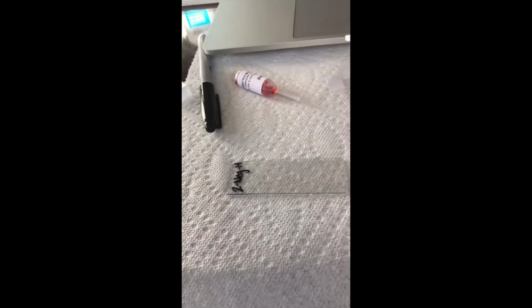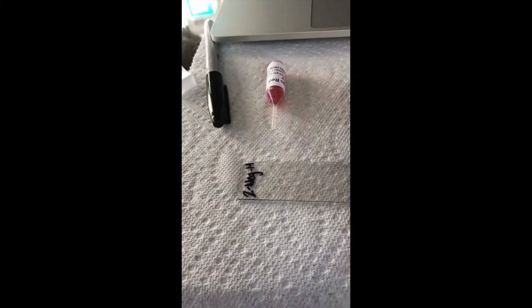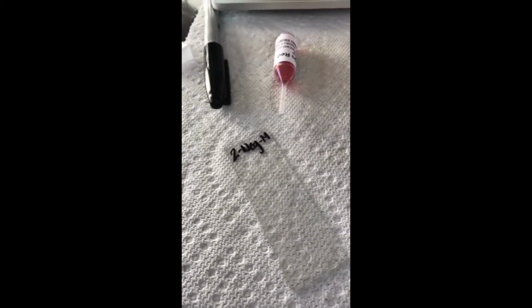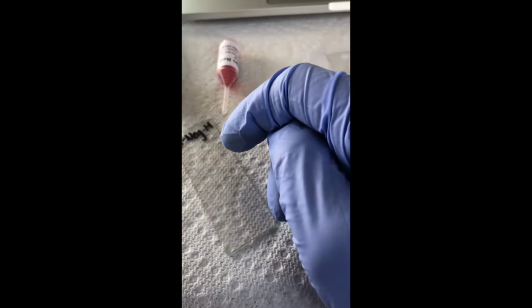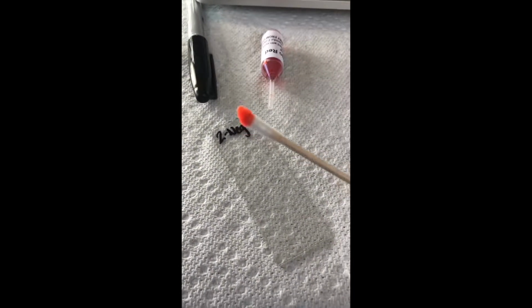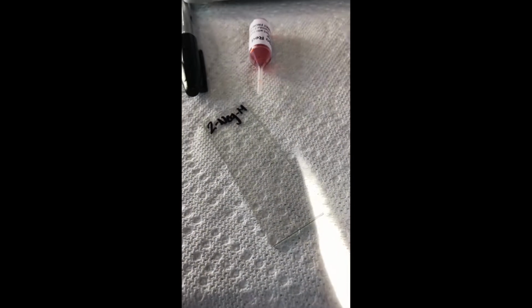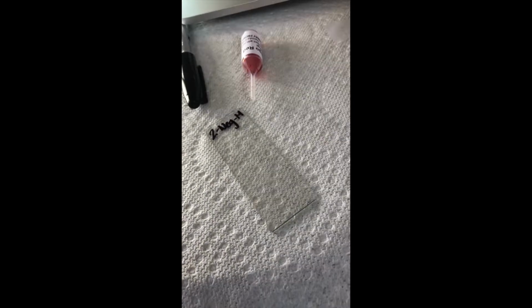This is the second portion of the staining technique, in which we put a drop of the Congo red just under the label, which is the second dye, and it's a negative sample or a negative stain. Then you took a sample again from the gums and teeth area, and we put the sample in the stain and agitated it so that the cells from the swab transferred to the slide, and then you used another slide to remove the excess liquid, and now we're just waiting for it to dry in order to observe under the microscope.